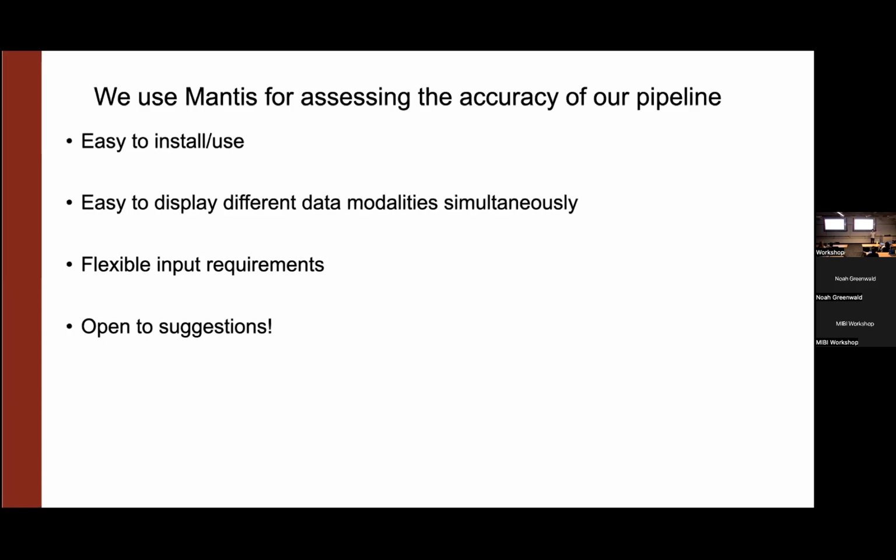Anytime something is not even a bug, it's just like, man, it would be nice if it did this, they're like, okay, cool. And then it does that. Obviously, that will cease to happen if everyone in this workshop starts doing that. But in general, they have been very receptive to useful, constructive suggestions that we have given them.